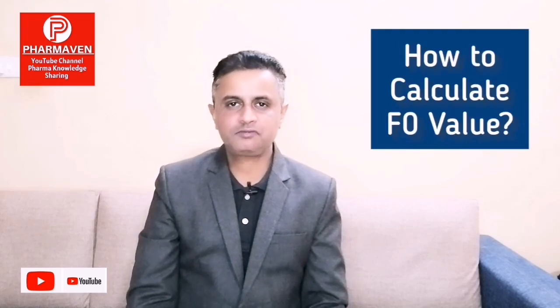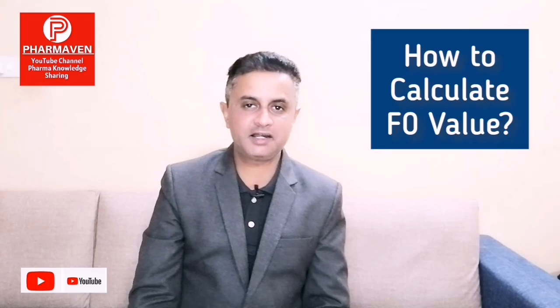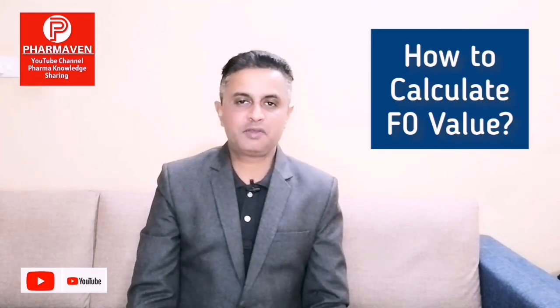Now that we have understood the importance of removal of air and the steam pulsing cycle design, let us understand how to calculate the F0 value for a desired biological indicator or desired biological known load. In one of my previous videos I explained what the F0 value and D value are. The F0 value is the equivalent time of exposure at the specified temperature of 121 degrees, and the D value is the time required to reduce the bioload by a factor of 10 at 121 degrees. So if my biological indicator strip has a bioload of 10 to the power 6, and to make it 10 to the power 5 it takes 1 minute at 121 degrees, then the D value of that biological indicator strip will be 1.